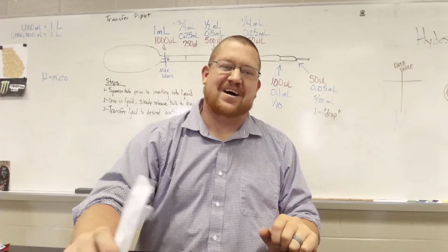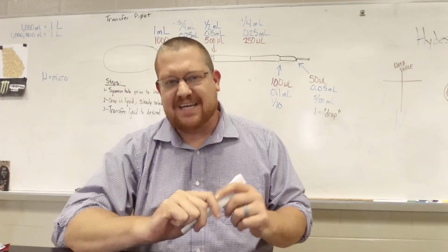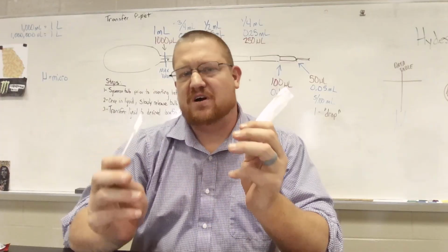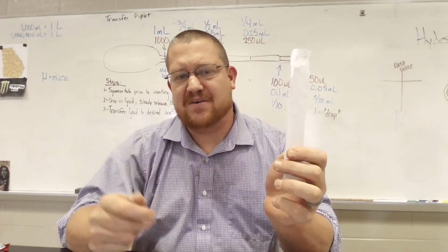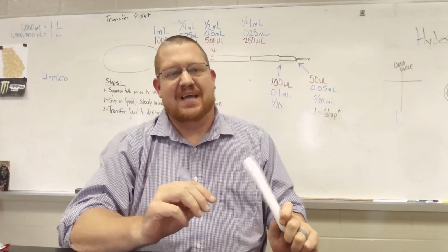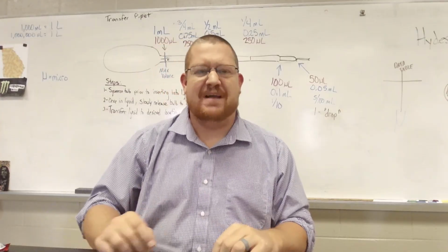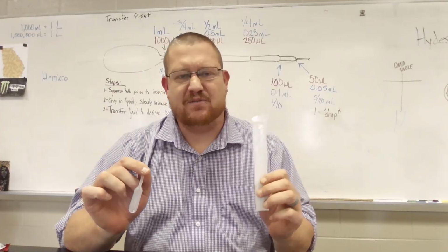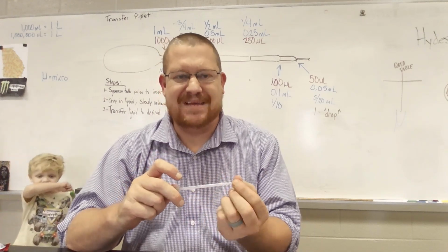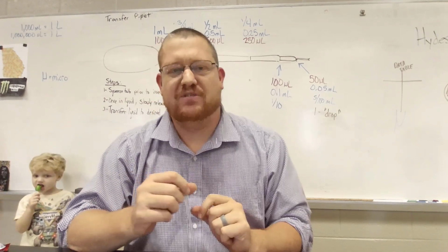So today, we talk about the transfer pipette. We're going to start out with the difference between the sterile and the non-sterile pipettes. And then we'll do a little activity to practice using them. And the main focus is just kind of identifying between these two and learning what these graduated marks mean and then how to pipette using those.